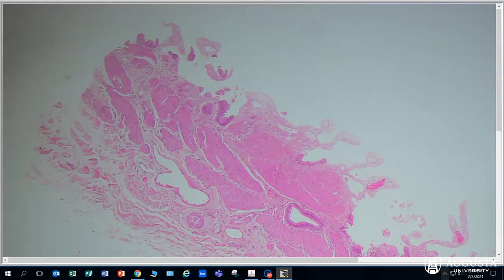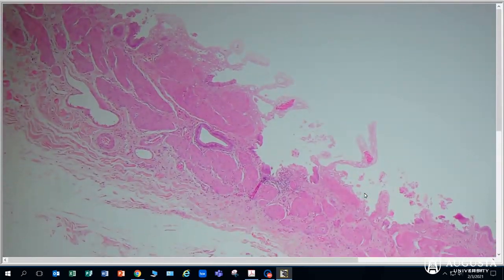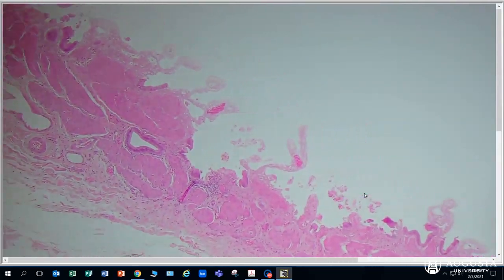In this slide, we are looking at part of our digestive system, and this slide will focus on simple columnar epithelium. So this slide is not in great shape, and I wanted to show you this slide because our slides are not always perfect. Along this edge we should see these beautiful, nice column-shaped cells, but this slide looks a bit in rough shape, and I want you to be able to focus on the good areas of that slide.